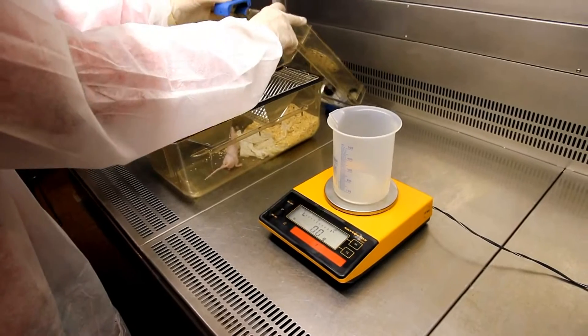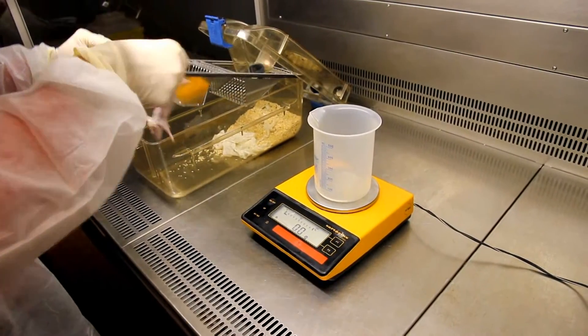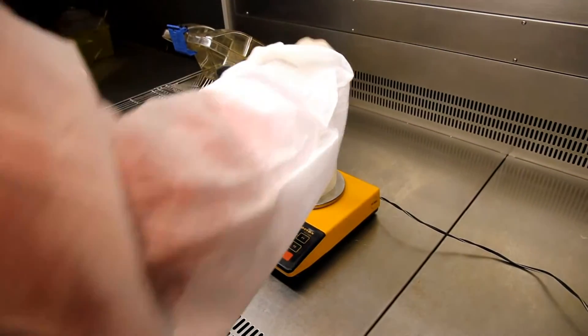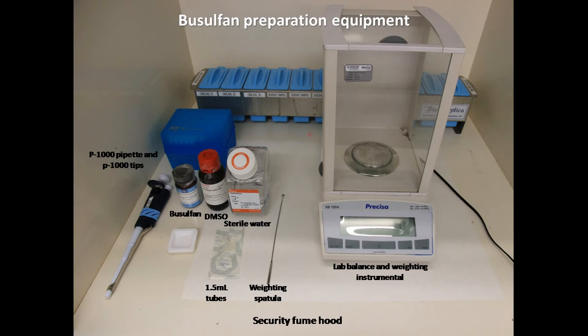Remember to work always in sterile conditions. Once we know the weight of the animals, we can proceed to preparing the busulfan to be injected. Here you can see the materials for this purpose. Due to the high toxicity of busulfan, which is an alkylating agent, remember always to work in a biosafety cabinet fume hood using gloves, lab coat, and mask for your own security.